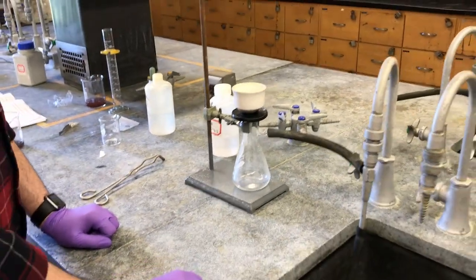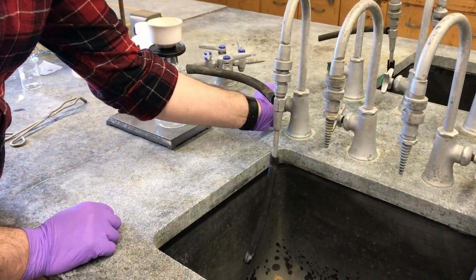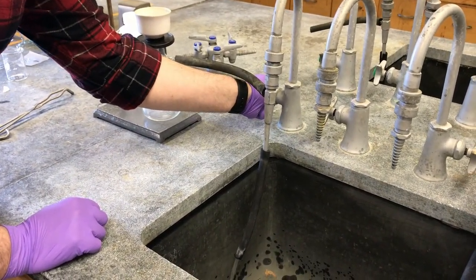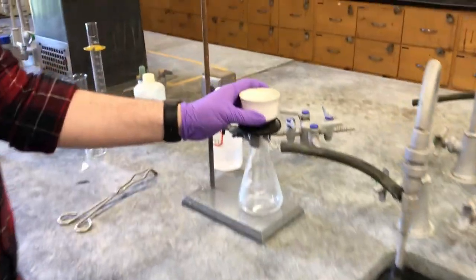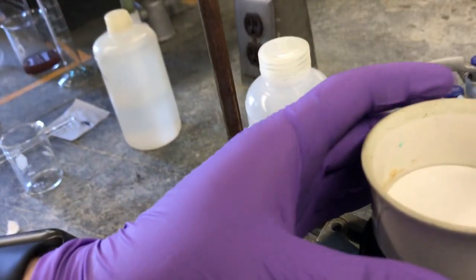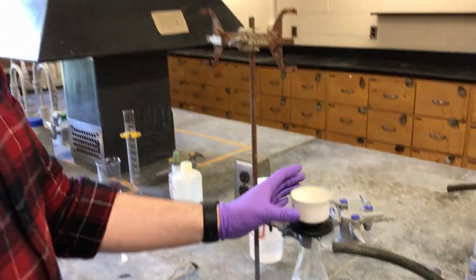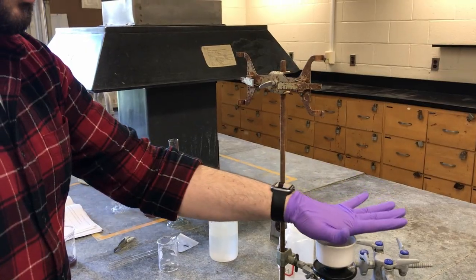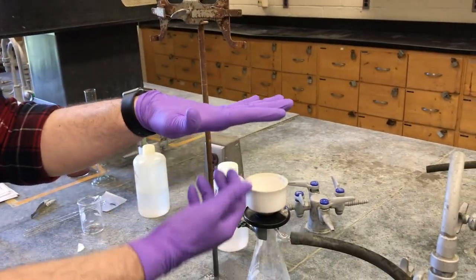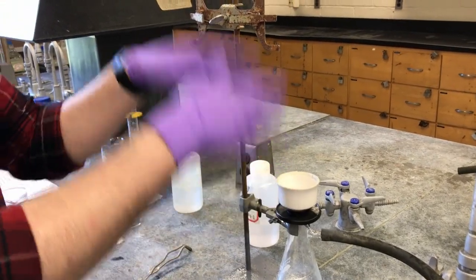So right now, we are ready to turn on the sink. I'm not sure if you can hear it, but you can hear sort of a vacuum noise. Make sure there are things that you don't want to do. One is you don't want to put your glove on here. It'll suck the glove into the vacuum. When you try to pull it off, if you have any sample, it might just pop and go everywhere.